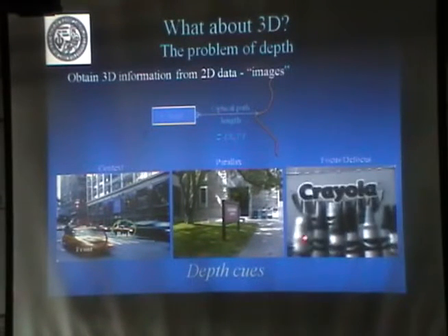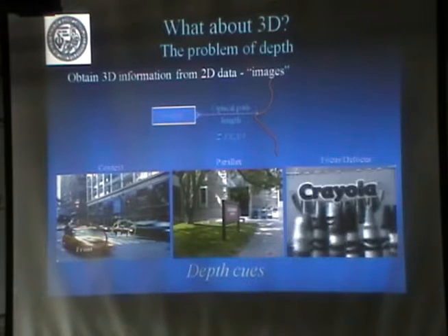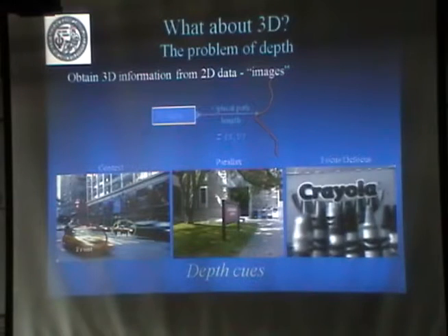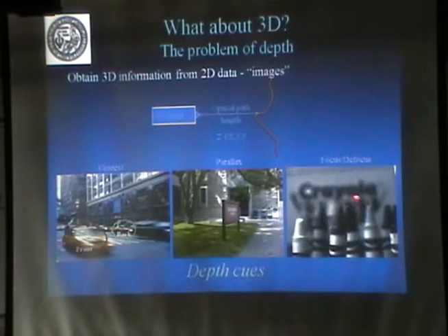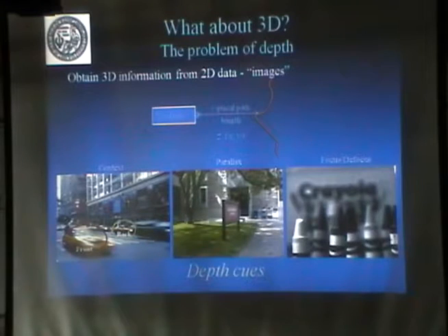So the other that is left is focus and defocus, right? So that works. You just take a lens and focus in different planes. People use that. Chris and the President talked about that yesterday. Well, the question is, is this lens the best way of doing this operation? If you want to distinguish distances in Z, is a regular lens the best way of doing it? So it turns out it's not. So you can make a better lens. In fact, it's going to be a bad lens, but which is better for this task.